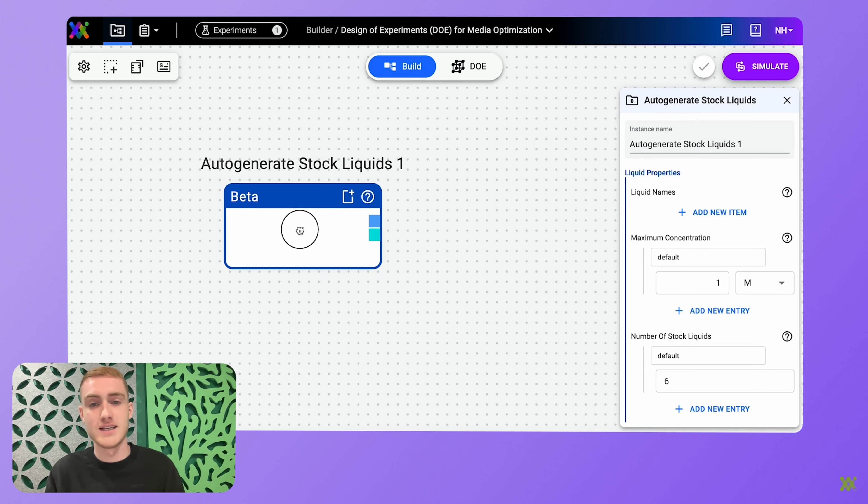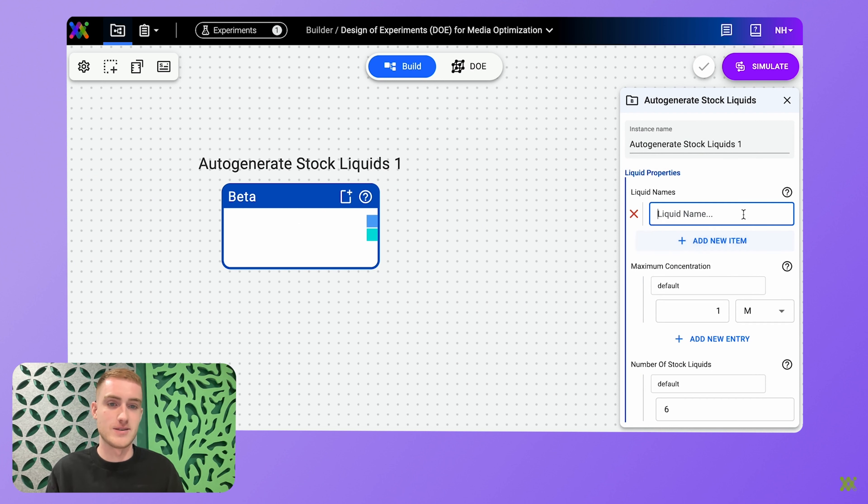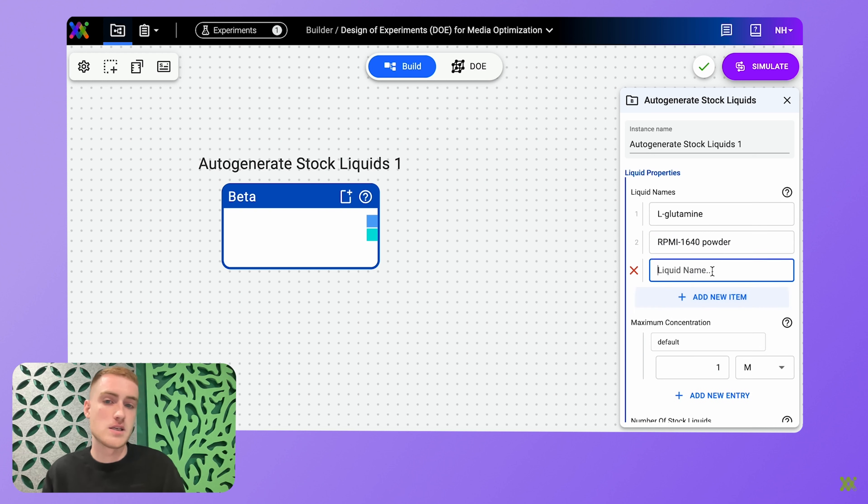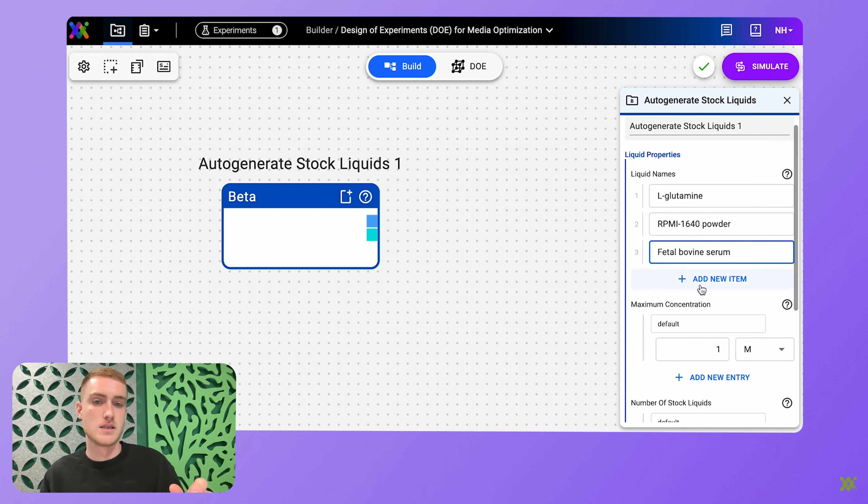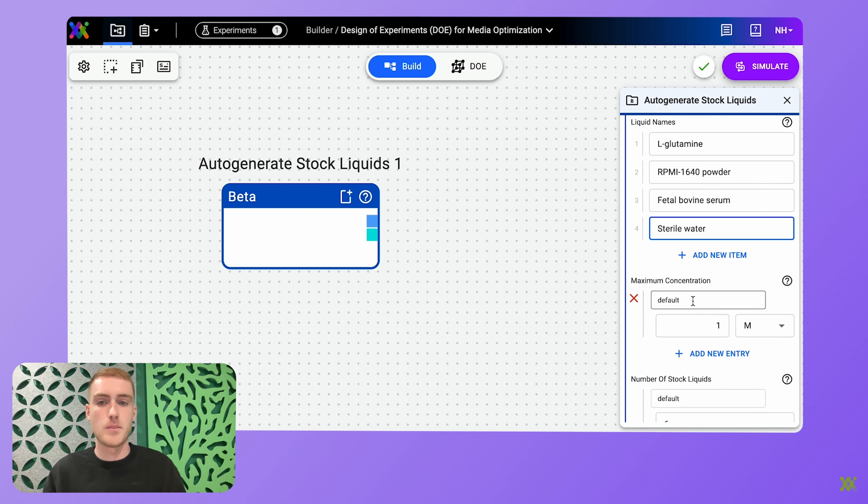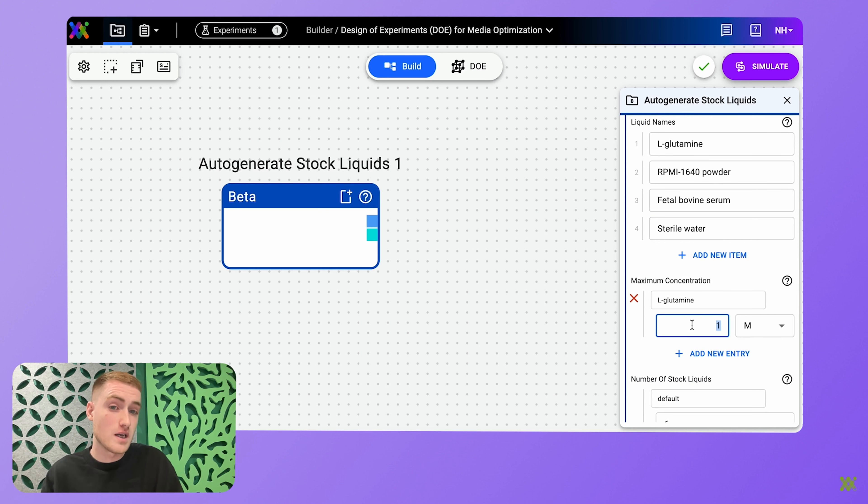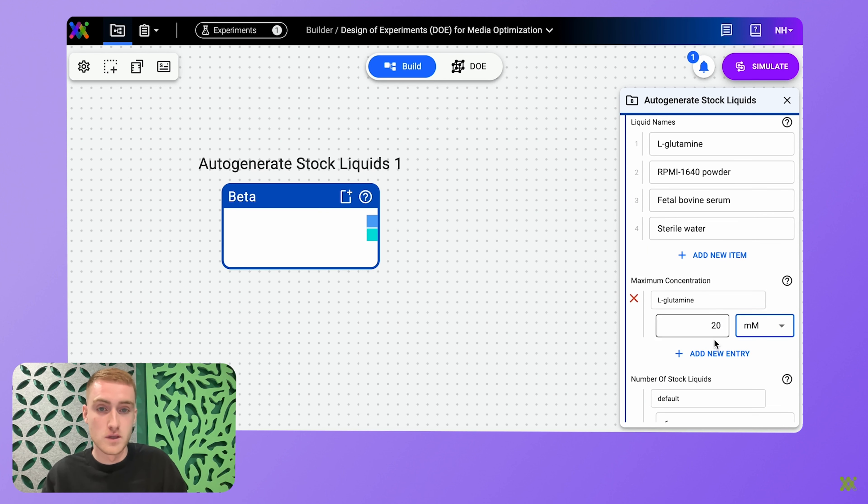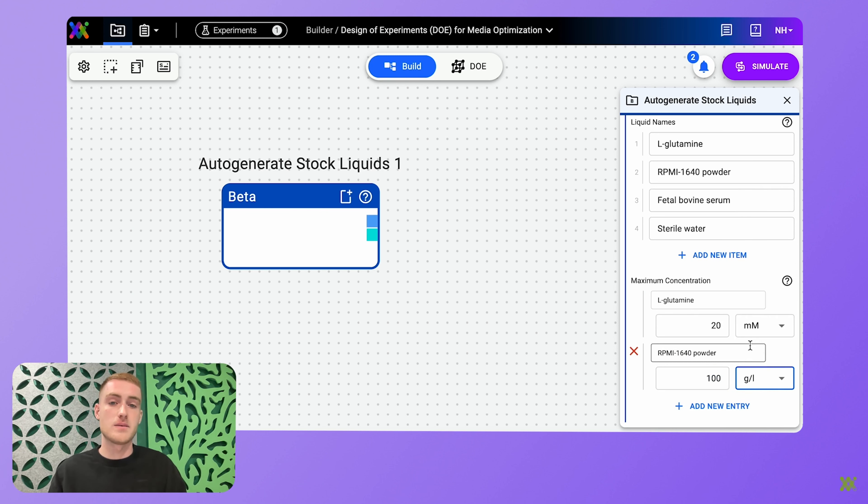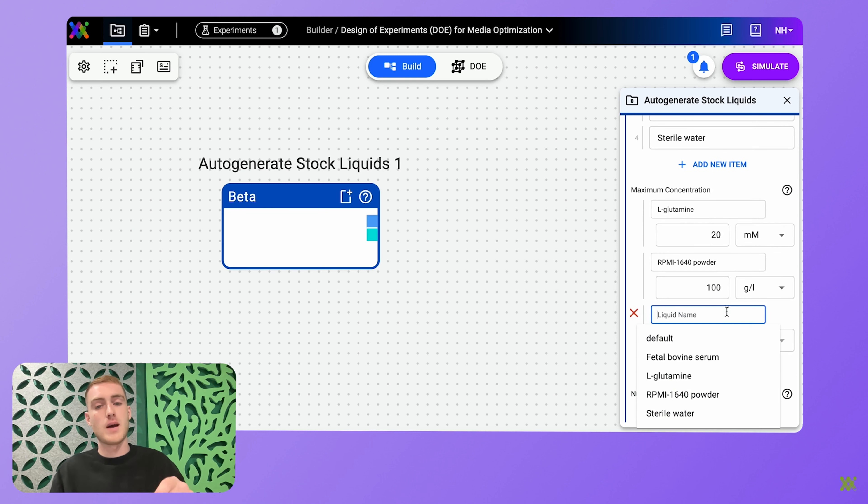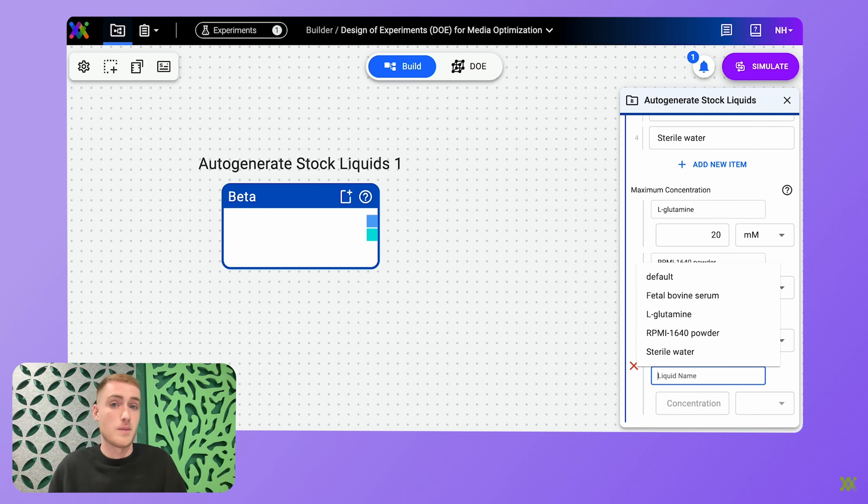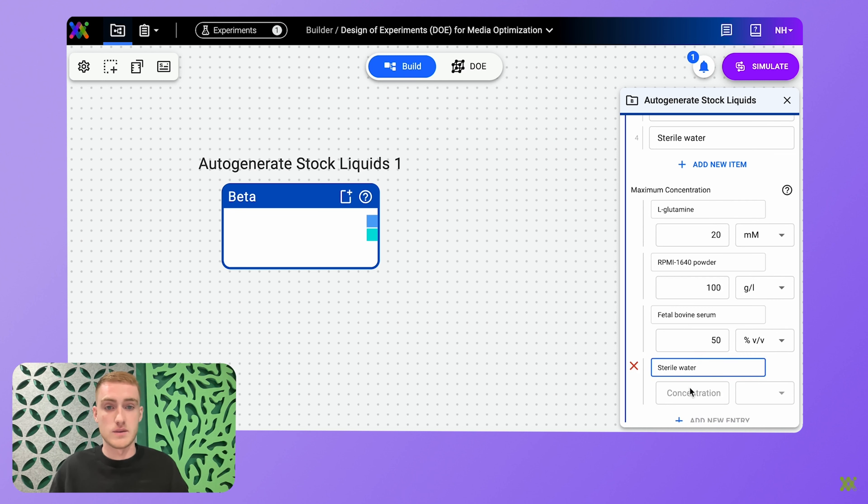I'm using this brilliant little element called auto-generate stock solutions. By defining my stocks in here first, Synthase will automatically tell me the ideal stock solution to prepare in my lab for this experiment that will satisfy my final desired concentrations, all whilst preventing my liquid handler from having to prepare minute volumes, which might be quite inaccurate.